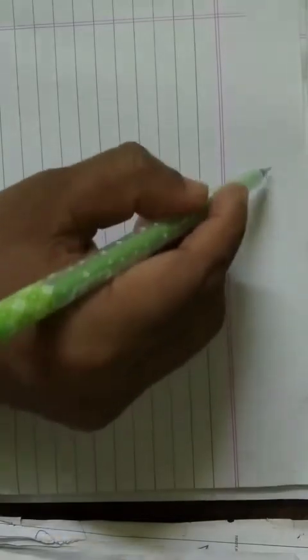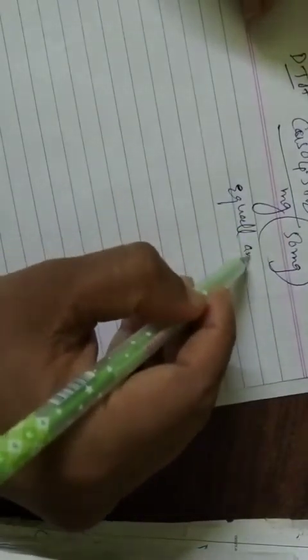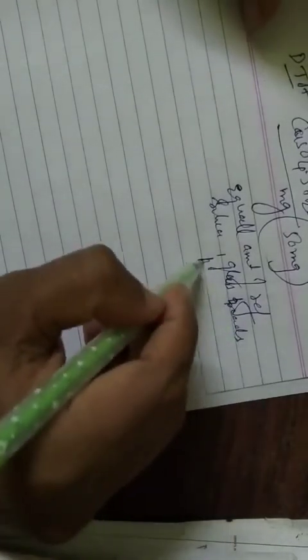Now to understand this more, we'll go to another DTA graph, of copper sulfate pentahydrate, okay. Usually the sample taken is in milligrams, like 50 milligrams, and an equal amount of reference sample is also taken. As I told, it is silica, or glass beads, any inert material, alumina, like this.